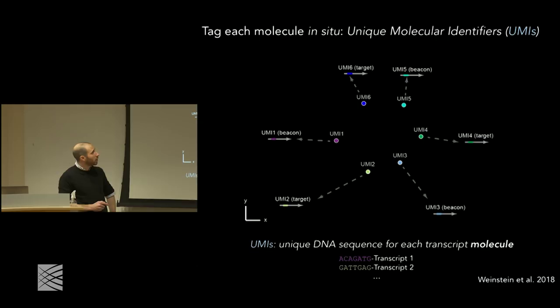there will be two different types of molecules that we'll be tagging, one of which we'll call beacons and the other which we call targets. Beacons, in this case, are going to be ubiquitously expressed genes. We'll just choose beta actin, the cytoskeletal protein, as our choice for beacons in these experiments. They're ubiquitously expressed genes whose sequence we're not interested in, but we're going to use them as basically locators relative to other molecules, namely the targets that we're going to actually fully sequence. And so those are the ones for which there might be an endogenous sequence that we're actually interested in. And we're going to get that data, and we're going to be getting targets to communicate with beacons, but beacons will not communicate with other beacons, and targets will not communicate with other targets. And so that's just a technical remark, but its importance will become clear soon.